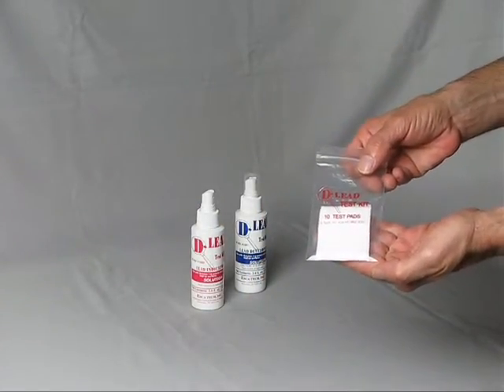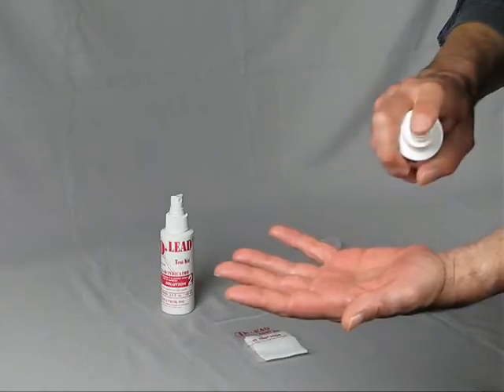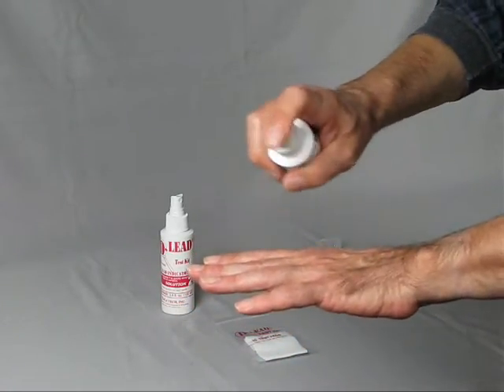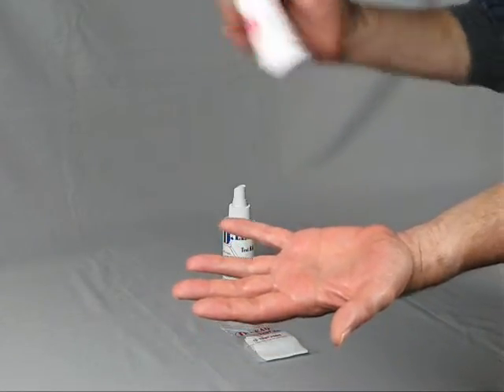To begin, spray Solution 1 on both sides of your hand 4 to 5 times until your hand is damp. Next, spray Solution 2 on both sides of your hand approximately 4 to 5 times.